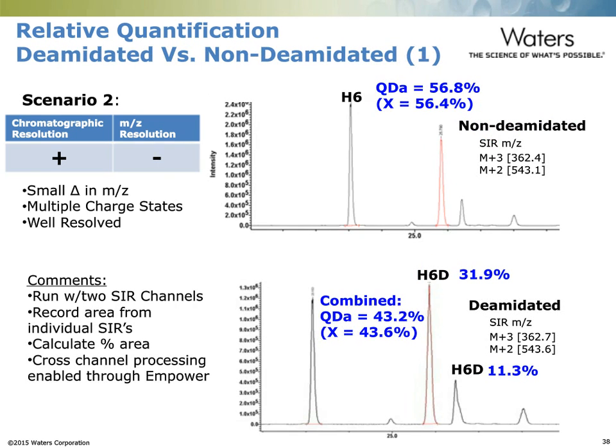Then look at the deamidated species. In this case, we have a peptide from the heavy chain, and then compare that to its deamidated form. We get very good agreement, again, between the QDA as well as the instrument in their laboratory, highlighting the general utility of the QDA for monitoring some of these critical quality attributes as part of a multi-attribute methodology.